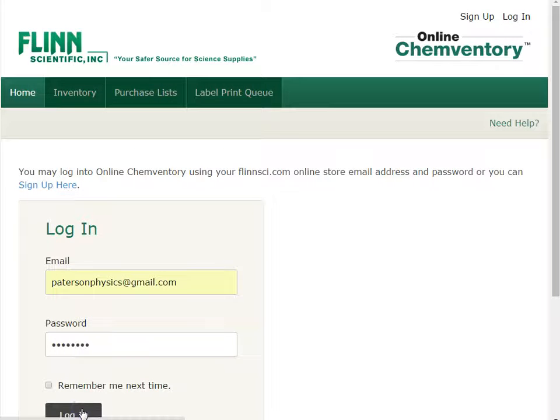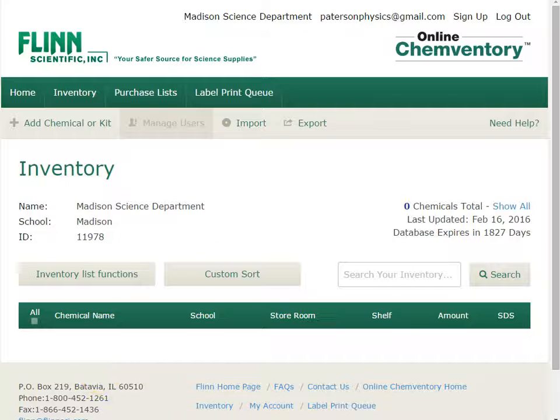and hit login. Now I've already put in my invitation code, so this is the screen that opens up for me. It'll probably prompt you to put in your invitation code, hit submit, and then you'll be brought to a similar screen. This ribbon up here has 4 buttons. This is where you're going to be doing most of the interaction with this screen.